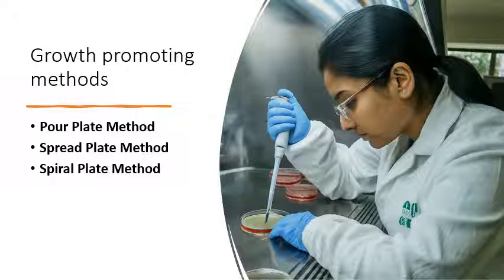Then the preparation is done by carrying out a serial dilution of your target microorganism after incubation. After standardizing the culture to something like a McFarland standard, or depending on the number of serial dilution diluting factor that must be used, then we proceed to pipette 0.1 ml of the culture onto an empty sterile petri dish.